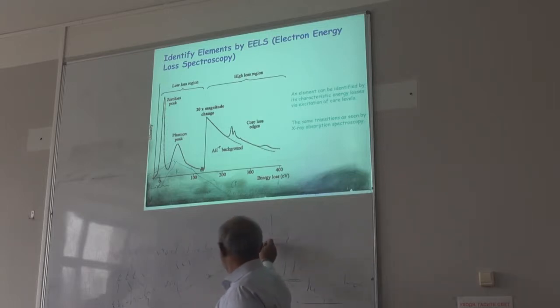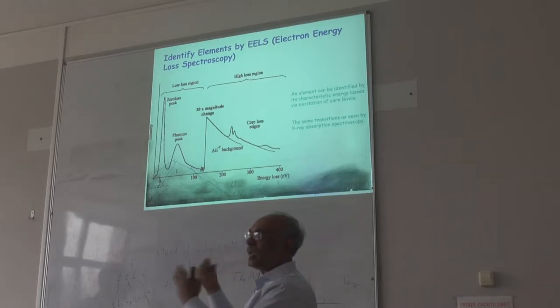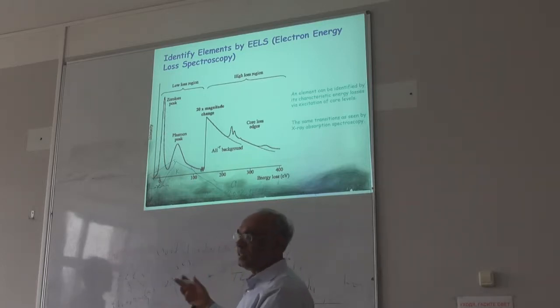If there is any event here, it will absorb some of this electron energy. Then whatever comes out is more like inelastic scattered light, right? If you look at that energy, that will give you some information about what is lost here. Then you can see what that is due to, either some plasmonic effect or something else.